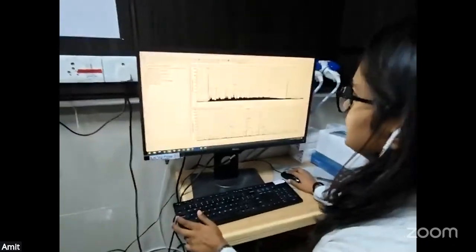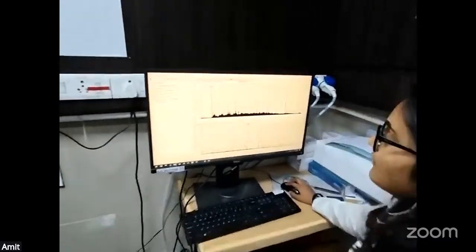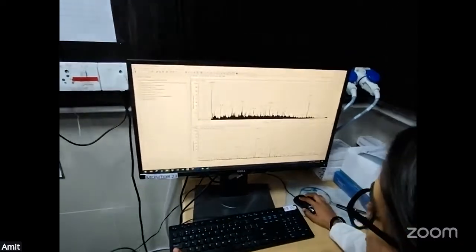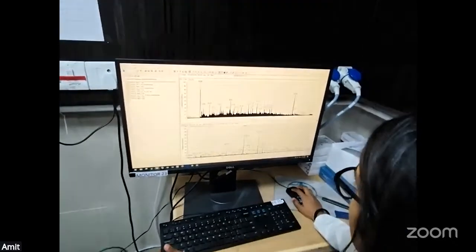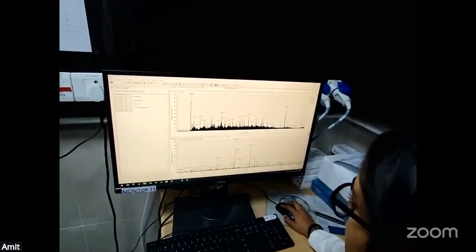Now I'll show you a chromatogram of a complex protein sample, and how it looks once the data is generated. This is how a chromatogram generally looks. You can see that we have run a 120 minutes gradient, and the elution has started a little after 10 minutes. Except for this intense peak, there's a little Gaussian pattern over here, and very dense peaks you can see.